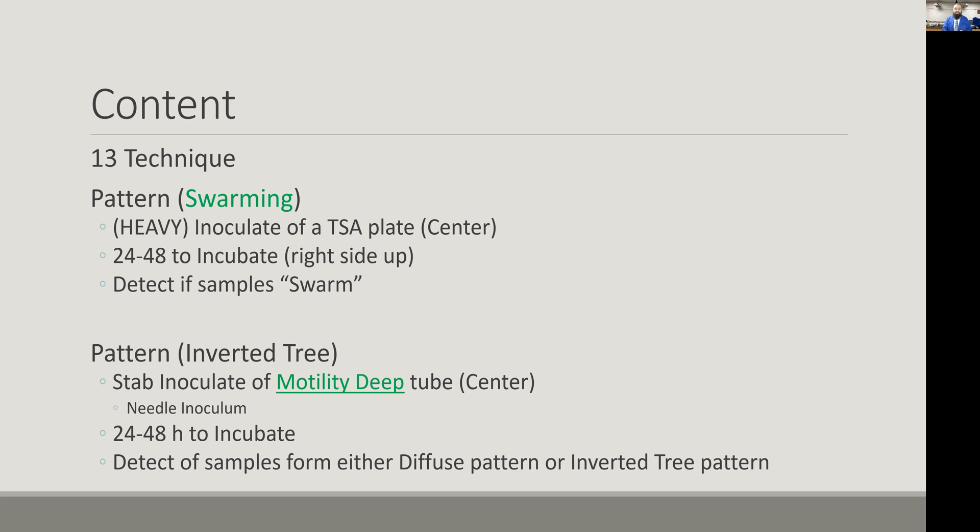Those are the two labs we perform for lab 13: a swarming pattern and a motility deep with inverted tree pattern. If we see these patterns, we can conclude that the organism is motile—that it moves. In collaboration with lab 12, we can establish whether an organism is truly motile or behaves with Brownian motion. In a moment, we'll show you what those images look like.